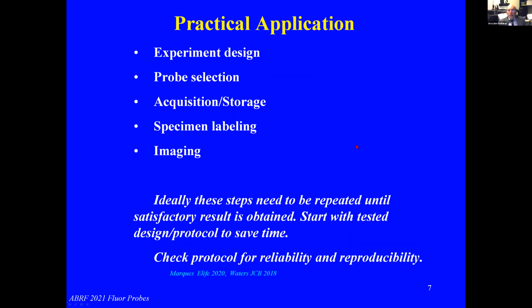Next, in a practical application of the fluorescent probe, we need to pay attention to experiment design, probe selection, probe acquisition and storage, specimen labeling, and imaging.